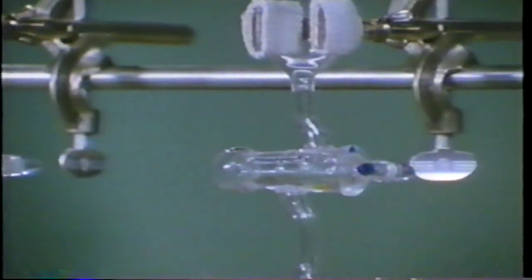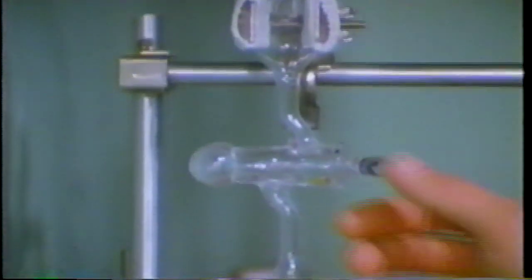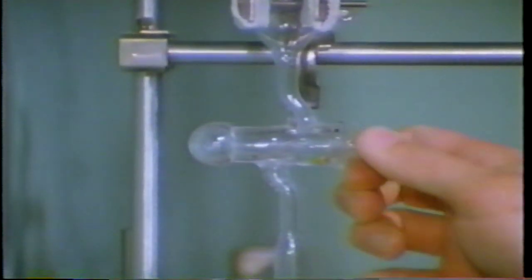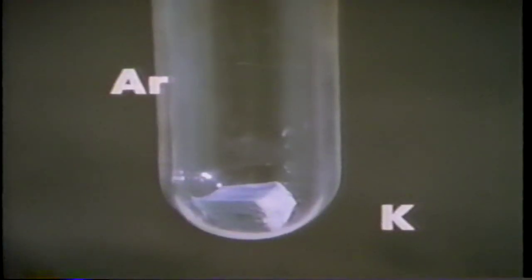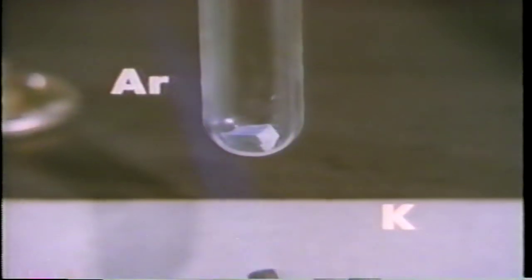When this stopcock is opened, the gas can leave the bulb. A small piece of potassium metal has been placed in each evacuated reaction tube. Each piece of potassium is coated with oxide, the result of reaction with air. Let's try argon first. Opening the stopcock allows the argon to enter the reaction tube containing the potassium. There is no apparent reaction. Let's try heating.